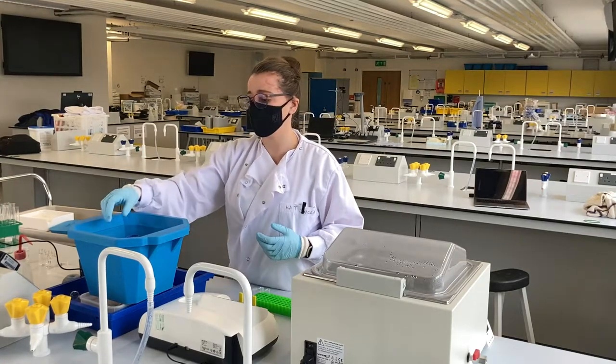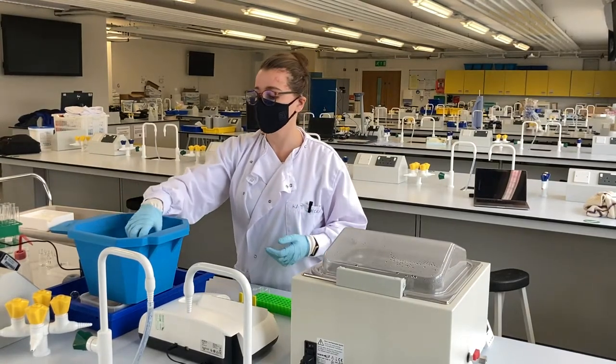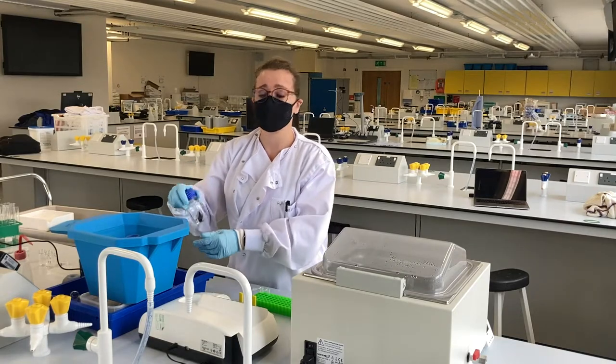Before conducting your experiment, it's important to bring your reagents up to temperature first. We keep the trypsin on ice to make sure it doesn't self-degrade.